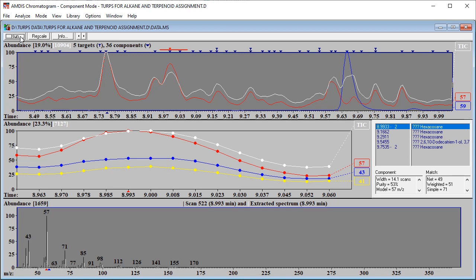That process was very fast, but then we're only looking at a tiny proportion of the total GCMS dataset. AMDIS only processes the parts that are visible in the chromatogram. You'll also note that AMDIS has added an extra couple of windows to the middle of the display, but ignore them just now and just concentrate on the top chromatogram panel and the bottom mass spectrum panel.